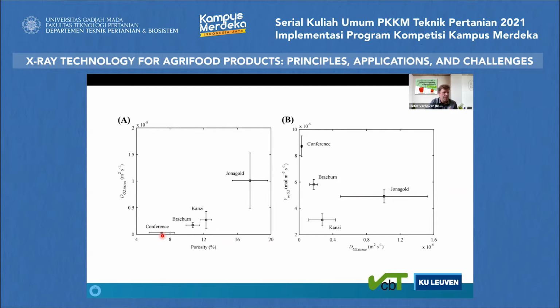So the typical pear cultivar that we consider has very low porosity, below 8% in this case. And other products like certain apples, the most common apple cultivar in our region is Jonagold, has more than double the porosity. You could think about how relevant that is, because of course the porosity is higher, so you can say you're selling more air with the product, which could be beneficial, you could think. And of course it's less mass, but that's not the relevance here.